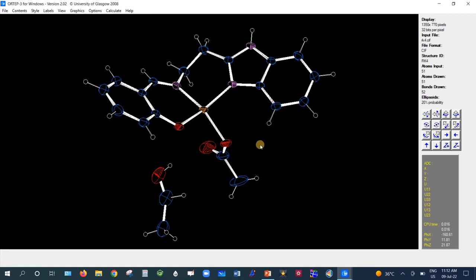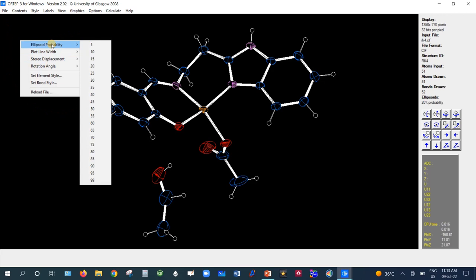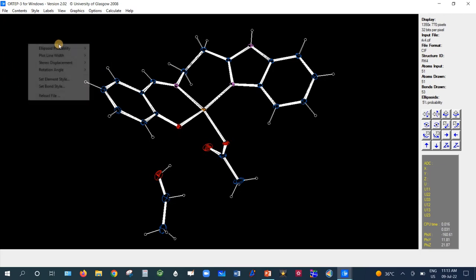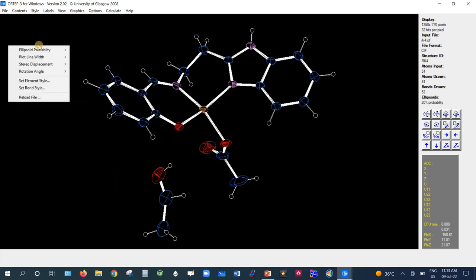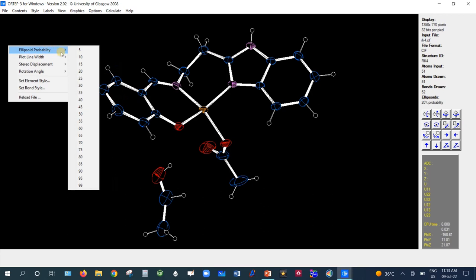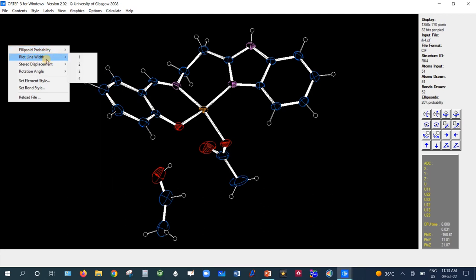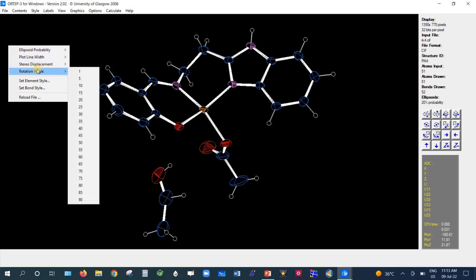This is the situation for the molecule to draw the diagram — all atoms can be seen. First, we will set the ellipsoid probability for the atoms. The ellipsoid probability can be set from 5 percent up to 99 percent using ORTEP-3. Generally, we keep the value from 20 to 60 percent. Let us take the value 20 percent. Then right-click to adjust the plot line width, stereo displacement, and rotation angle.